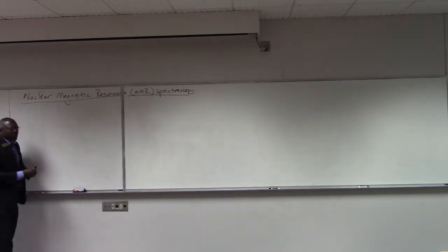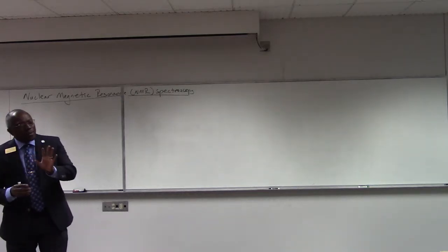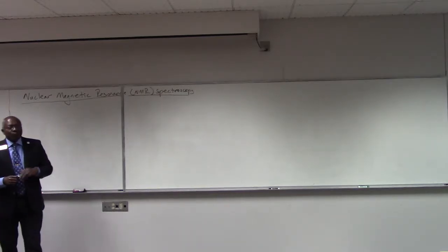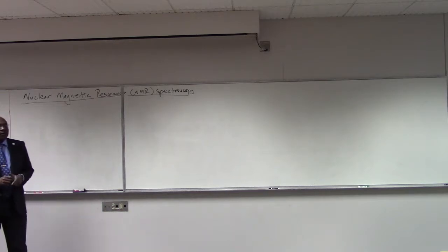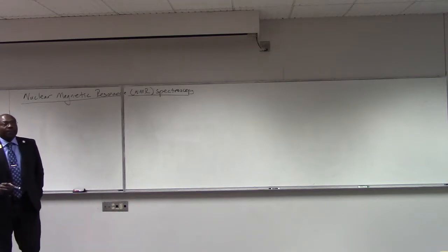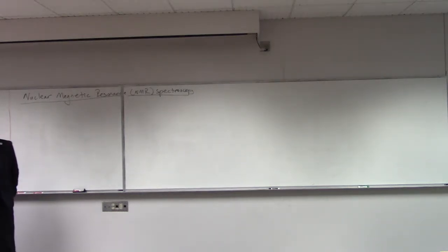And what I'll do in this lecture is to try to just introduce very briefly the physics of NMR. We won't go into any sort of great detail, it's not absolutely necessary. But just enough to have a working knowledge of how it operates. So we look at some very brief indication of the physics of NMR, and then we'll get into what an NMR spectrum looks like, what are the things that contribute to it, what can we glean from an NMR spectrum, and then we look at correlation tables and try to do some analyses of NMR spectra.